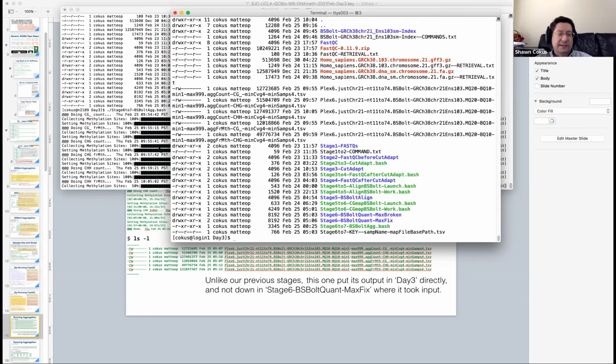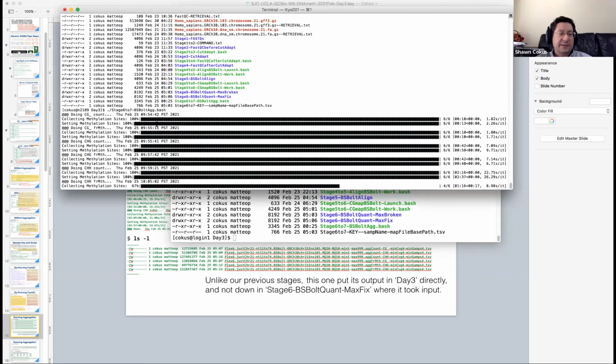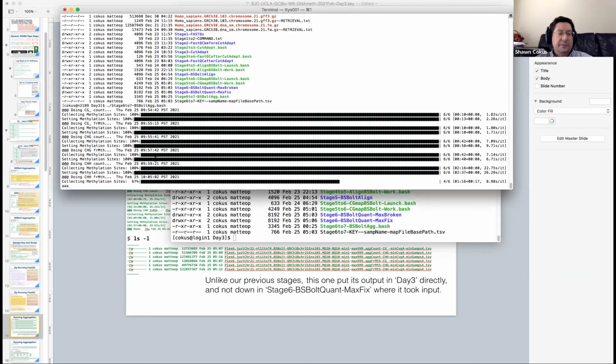All right, so how's this going in the background here? We've got 1, 2, 3, 4, 5 of them run. Oh gosh, there goes my A key. It disturbs our beautiful progress bar. Maybe it'll recover. Yeah, the A key just sort of takes off on its own sometimes now.